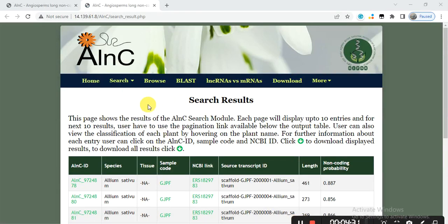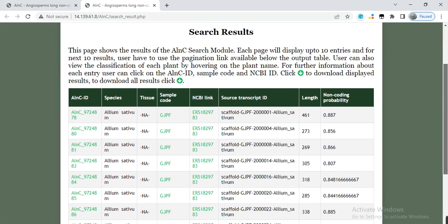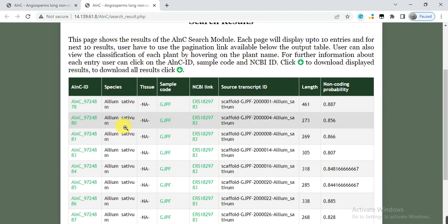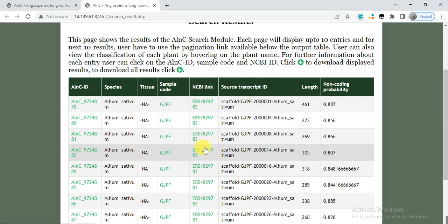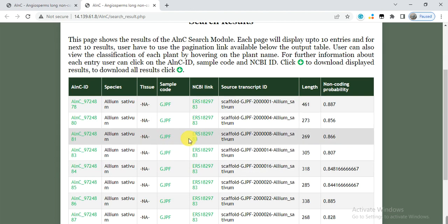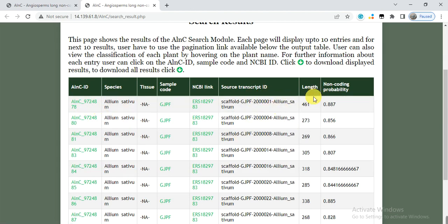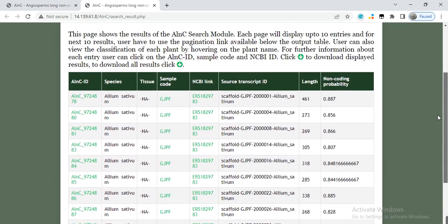The database will return all the long non-coding RNAs present in that species. The columns show the species name, the tissue — in cases where tissue was not mentioned in the source data, it says 'not applicable' — the sample score, the NCBI link to the data source, the transcript ID from which the long non-coding RNA was extracted, the length, and the probability value. There are about 66 pages of long non-coding RNAs for this species.